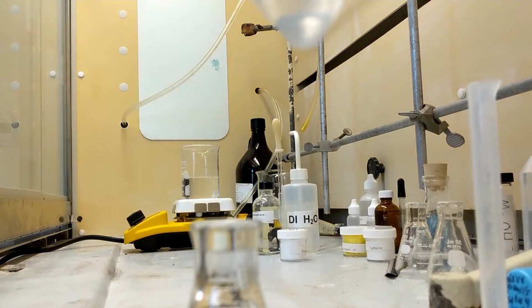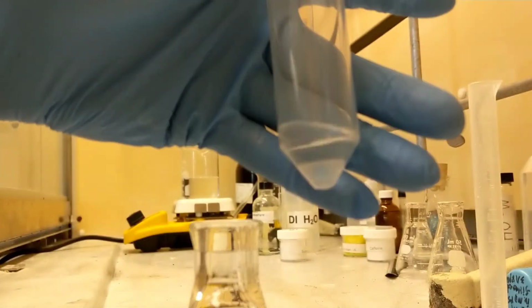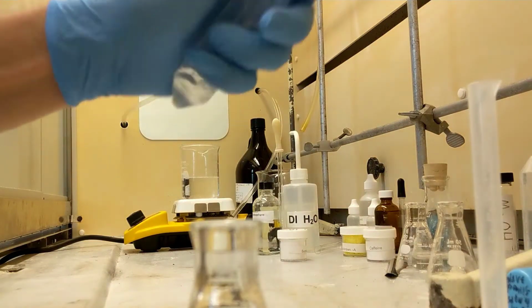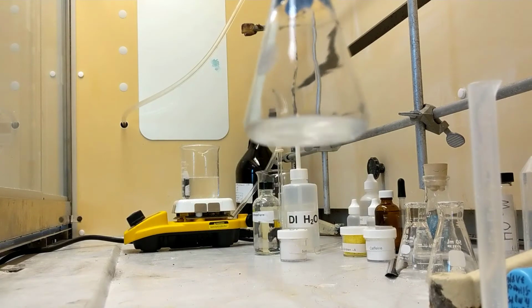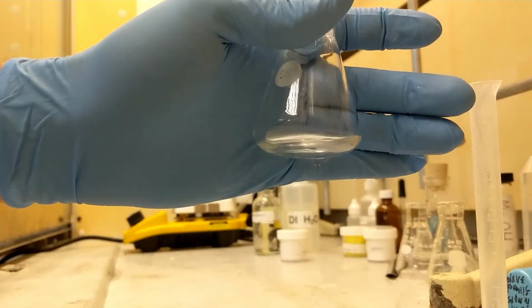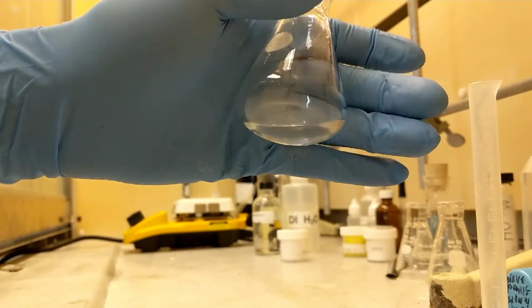All right, and if you can look now, no methylene chloride in there, no layers. I got it all in here. And if you can look through and see, my hand in front of it like a beauty guru. If you can look through and see, it doesn't look like there's 2 layers, but I'm still going to dry this anyway. It's going to be the same procedure for drying.